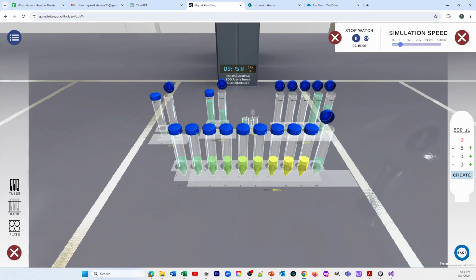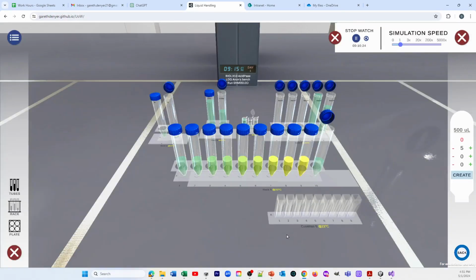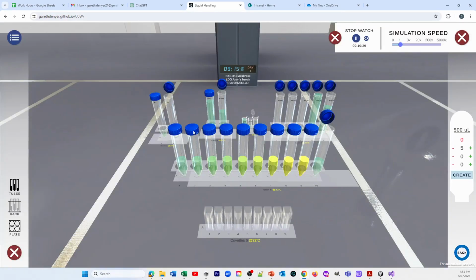So now it's a question of putting these solutions in effect. And I've got what? 1, 2, 3, 4, 5, 6, 7, 8, 9 of them. So let's make a rack of cuvettes with 9 cuvettes and 9 empty ones. Whoops, I didn't mean to do that way round. I wanted to go 9 columns and 1 row. Thank you very much. And there are my 9 cuvettes. And now I'm going to open up all of these lids.